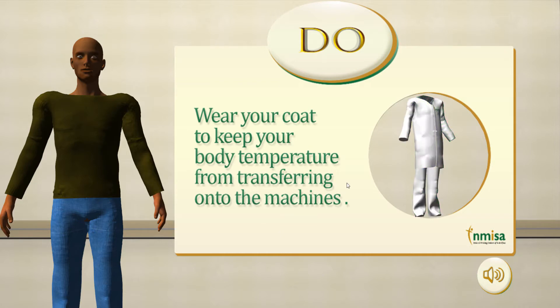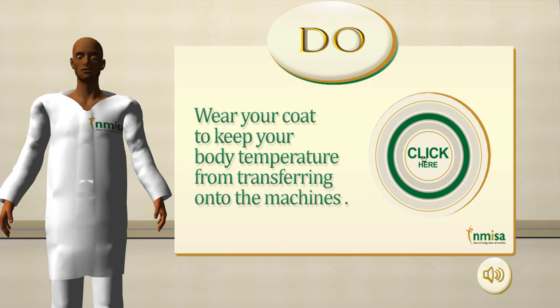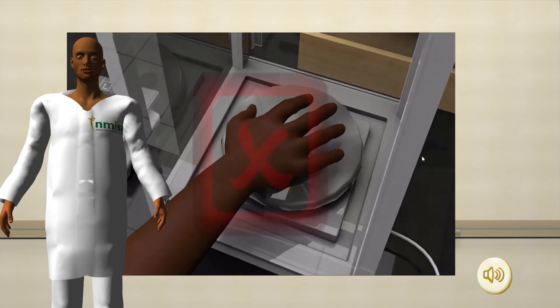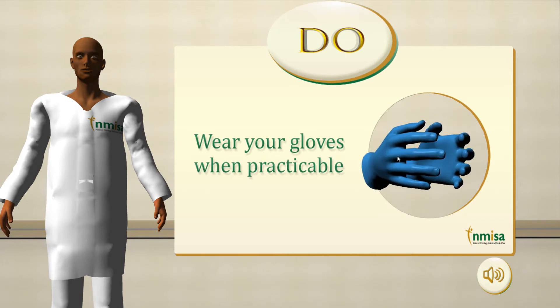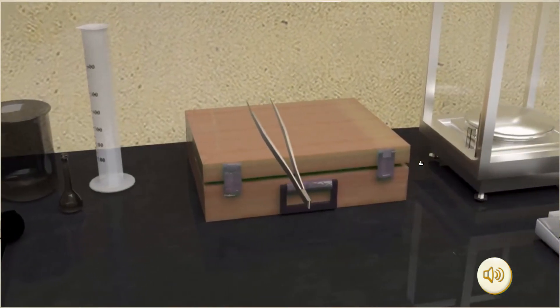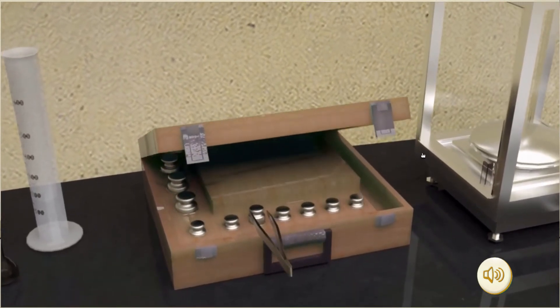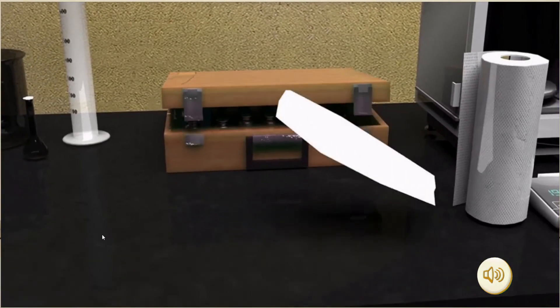Wear a lab coat to keep body temperature from transferring onto the machines. Avoid touching any lab equipment with bare hands. Always use specialized tweezers to handle the weights. Use acid-free tissue paper on the surface prior to using the weights.